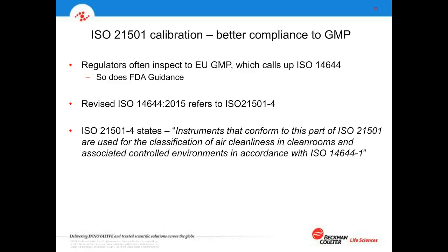And so you'll often find regulators asking for calibration documents, and now they're going to expect that those would meet or show a reference to 21501-4. Not instantly. I think regulators, even though they are very demanding, realize that it takes an industry some time to come into accordance with changes in the standards.